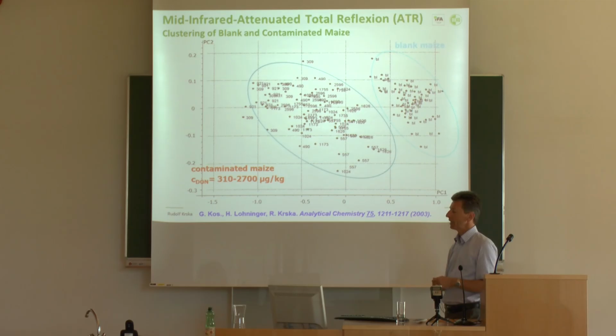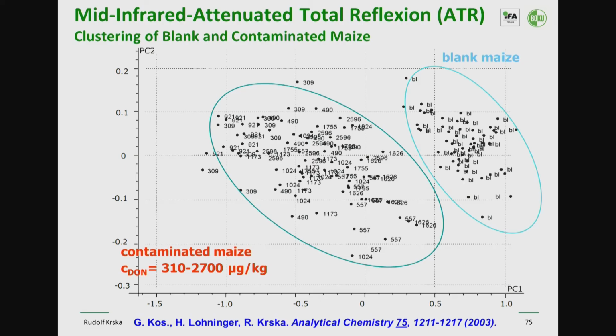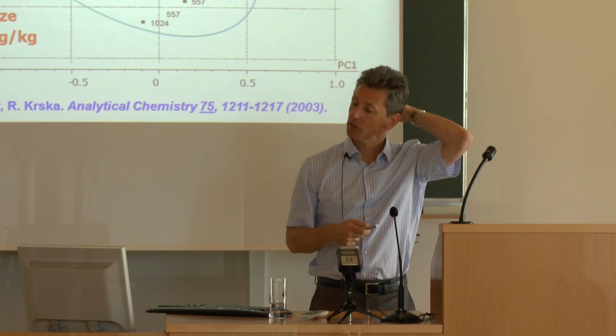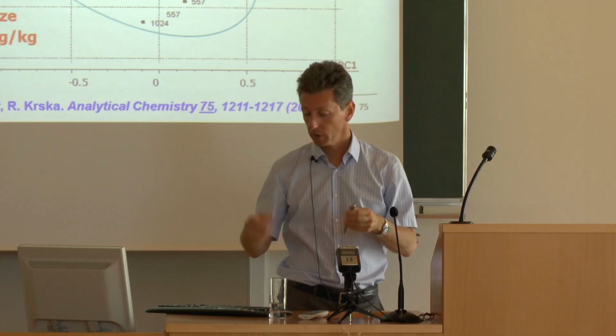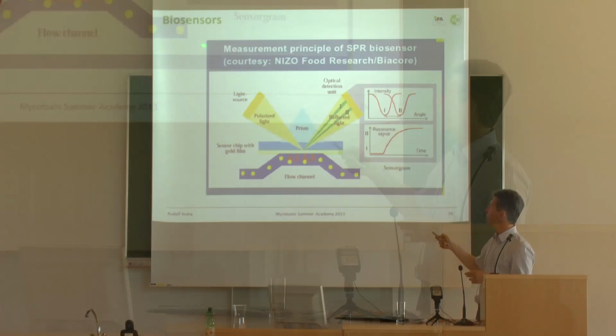And we haven't received further funding. There was also no interest from industry. Why? Simply because the light sources were not strong enough. Now there's a new generation of mid-infrared emitting lights, the so-called quantum cascade lasers. And these lasers can and will now be employed to further develop that methodology.